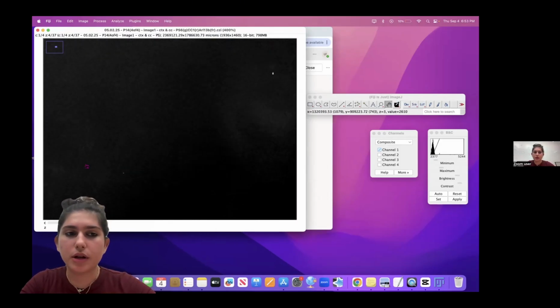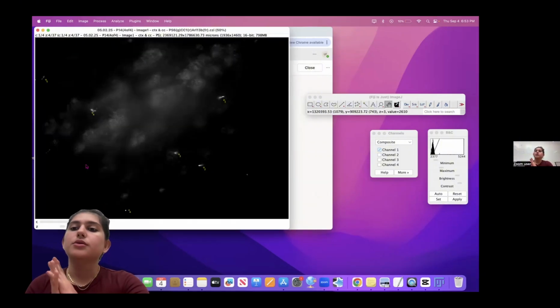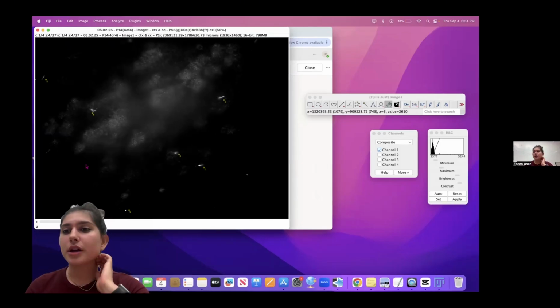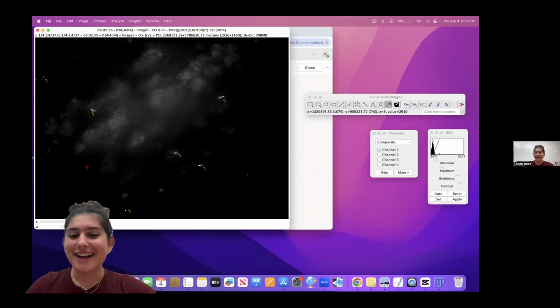I'm gonna make another video to show how to subtract background and the ROI, which I recently learned. So I will make another video showing that. I just didn't want this one to be too long, and I'm also at 10%. So yeah, that's gonna be all for learning how to open and do the basics of Fiji.